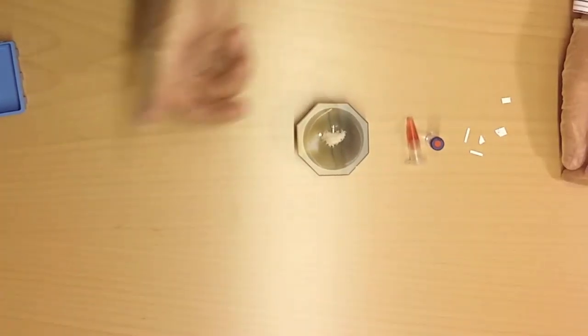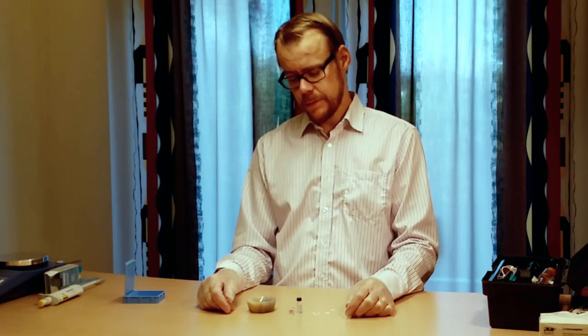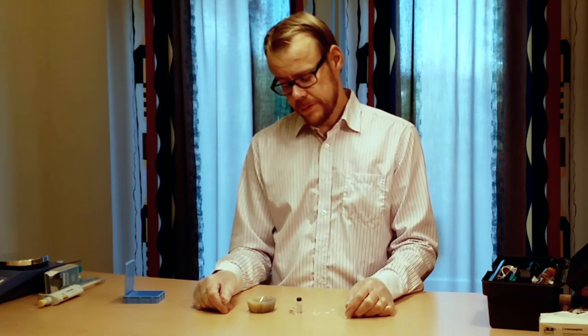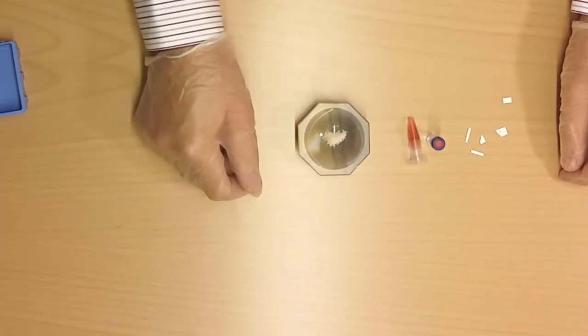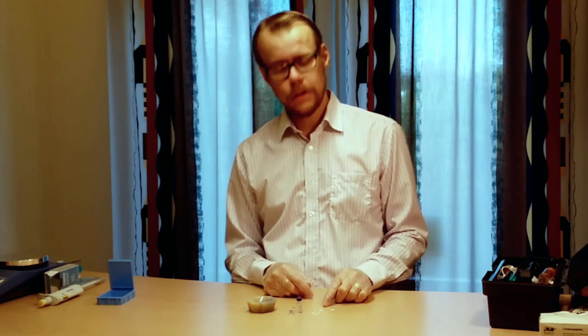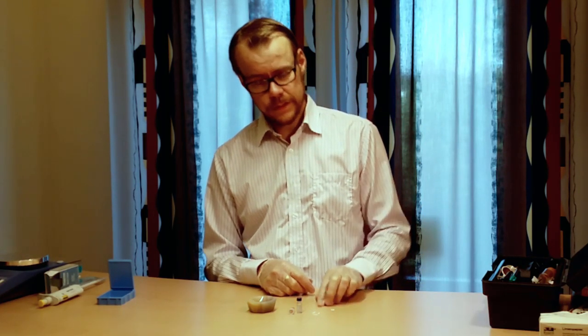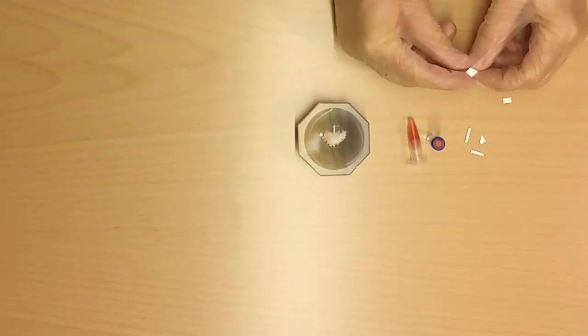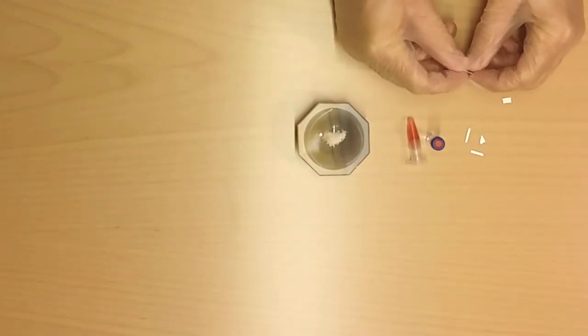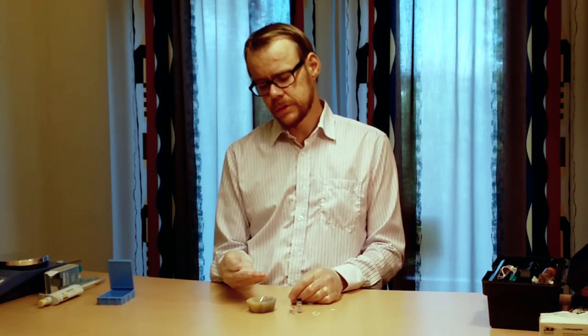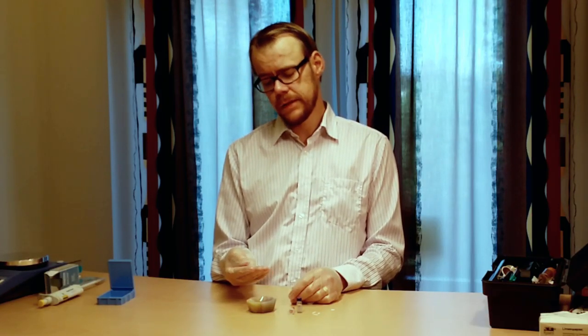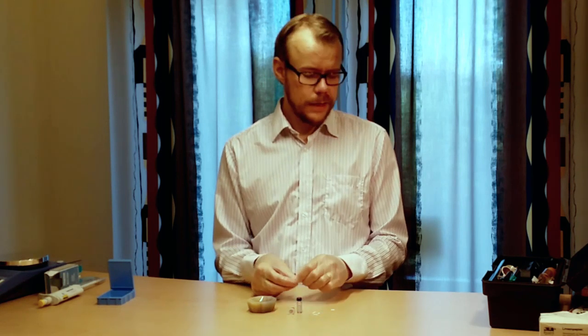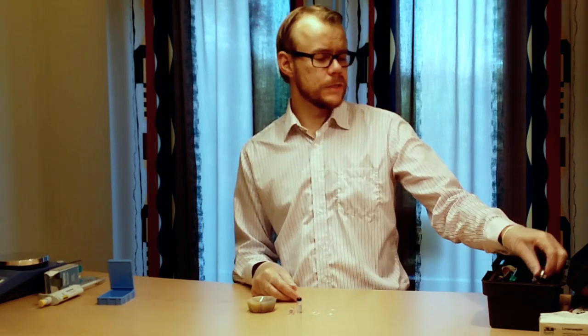So the goal is to prepare these ones so they will fit inside the microscope or to get them to get the right shape and properties. For example, if you have paper-based substrates like this, the most common thing is that you cut them into the right shape and you embed them in plastic. It is quite common that you want to see the cross section of the print and to do that, after the embedding, you polish it down.